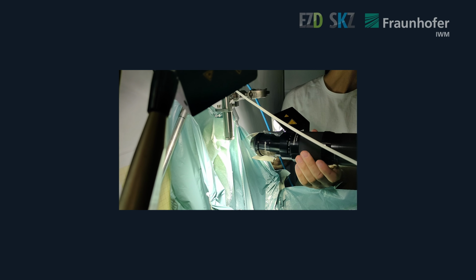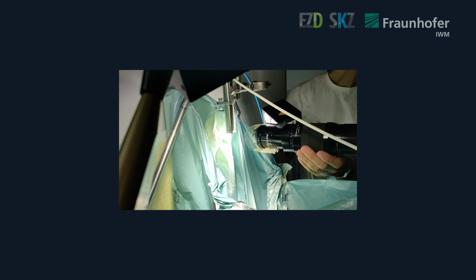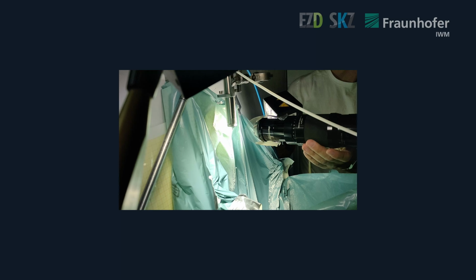The aim of this study was to measure the size of the droplets after they left the nozzle during spray drying. For this experiment, we used 2 high-performance light sources and a high-speed camera capable of capturing up to 7 million images per second at its highest setting.